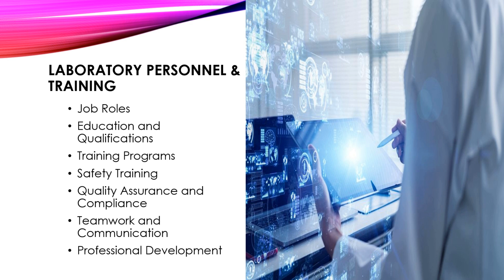field. Safety training. Safety is a top priority in laboratory settings due to the potential hazards associated with working with chemicals, biological materials, and other substances. Laboratory personnel receive training in laboratory safety protocols, including proper handling and disposal of hazardous materials, use of personal protective equipment (PPE), emergency procedures and risk assessments.